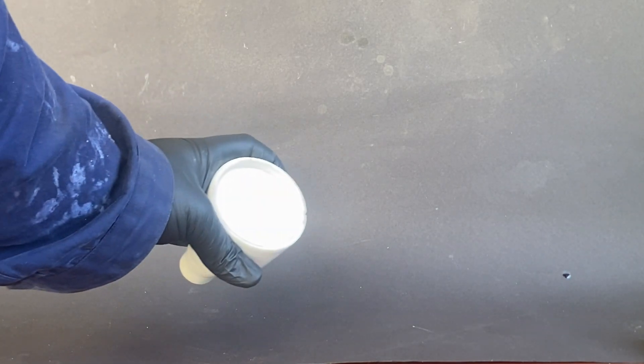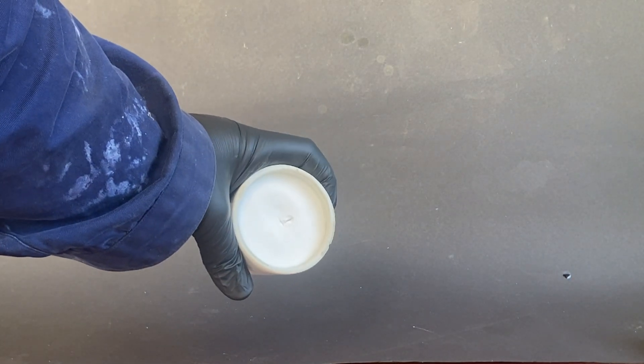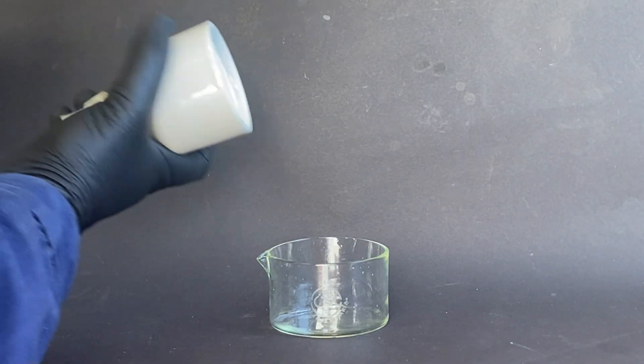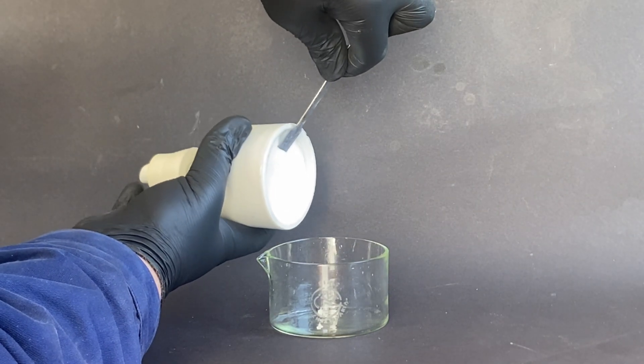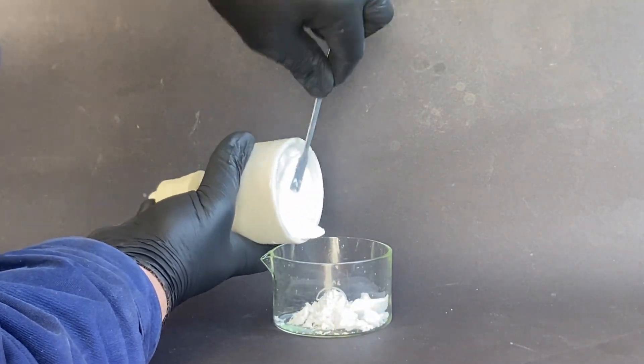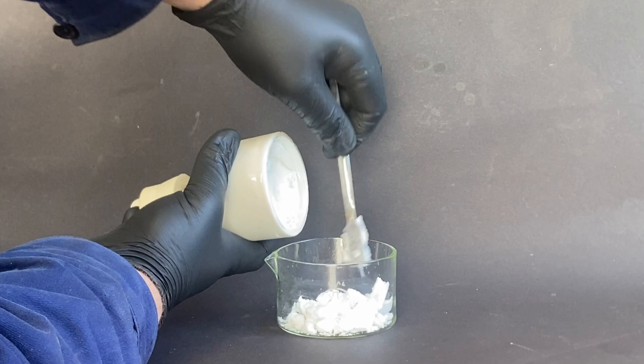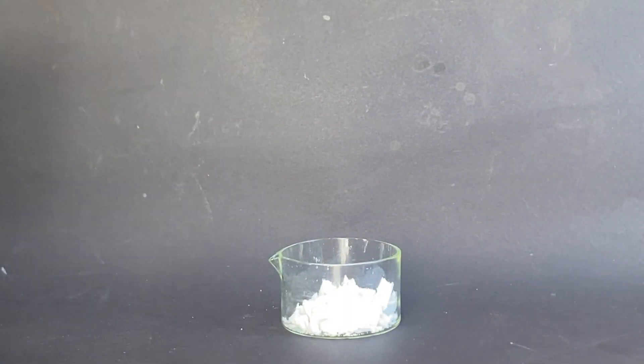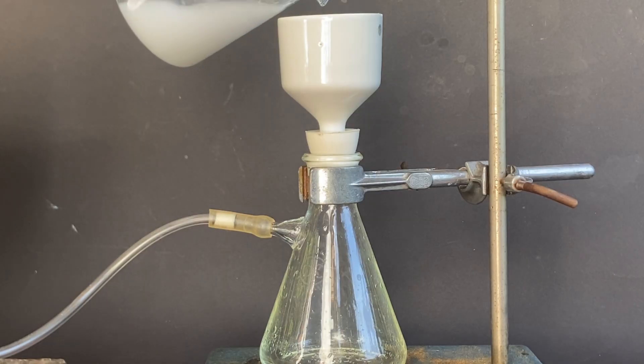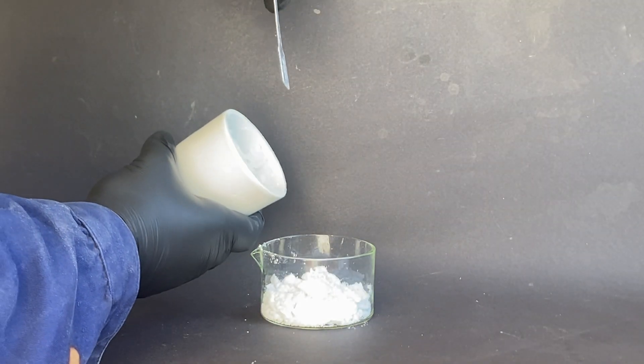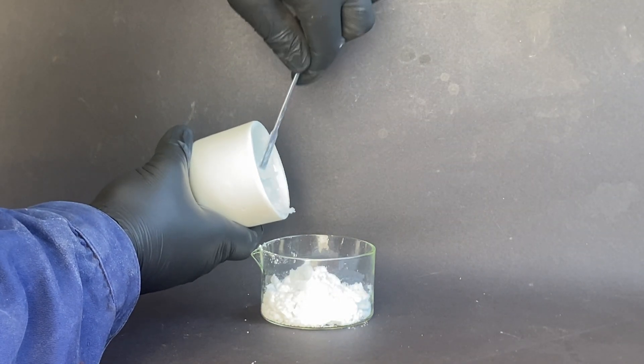Next I removed some of the boric acid into a dish and filtered the rest of the solution, making sure not to drown my pump again. After the filtering was complete I added the boric acid to the rest.